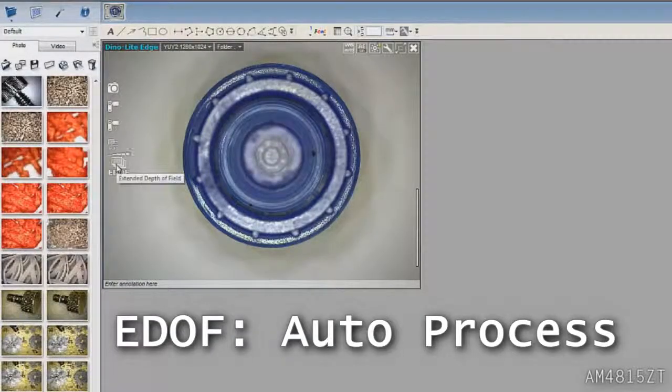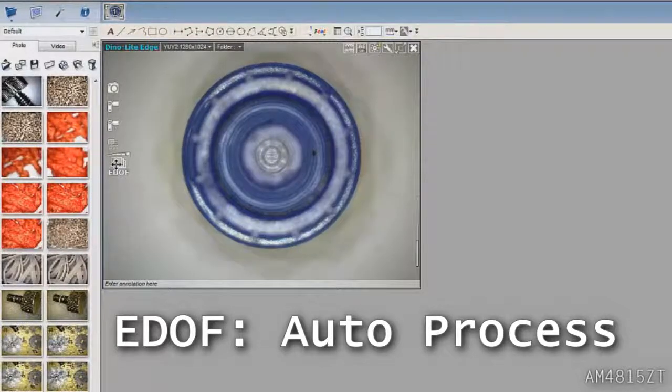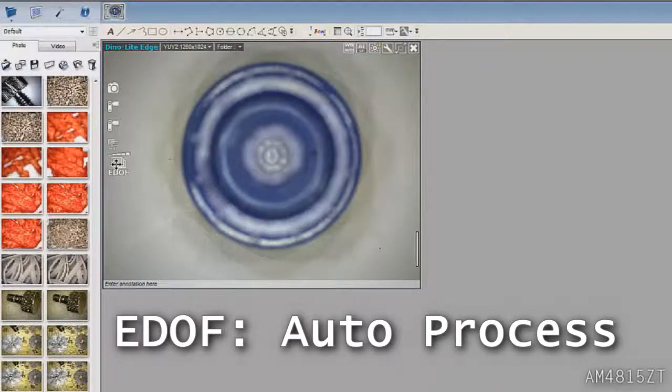When using EDOF, start at the highest focal point to successfully capture a clear, deep image.